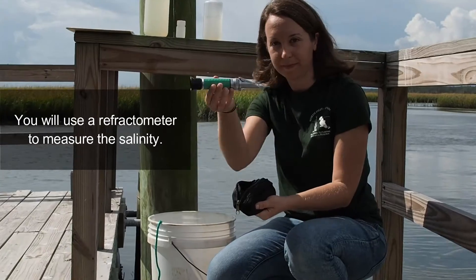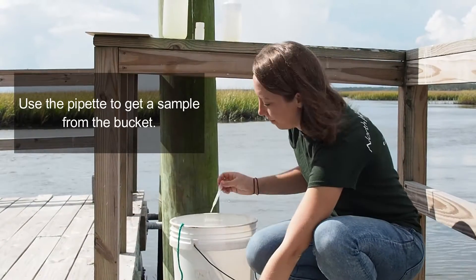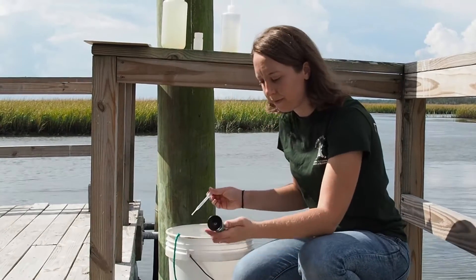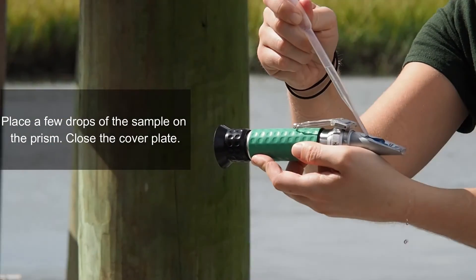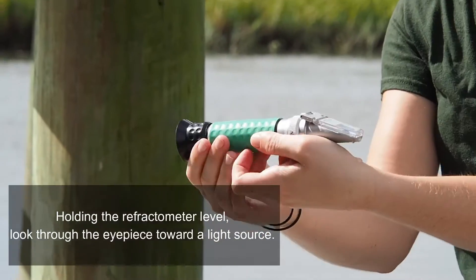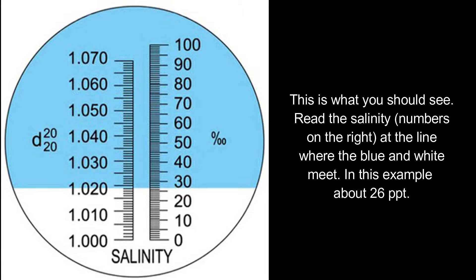You will use a refractometer to measure the salinity. Use the pipette to get a sample from the bucket. Place a few drops of the sample on the prism and close the cover plate. Holding the refractometer level, look through the eyepiece toward a white light source. Read the salinity — the numbers on the right — at the line where the blue and white meet. In this example, it's about 26 parts per thousand.